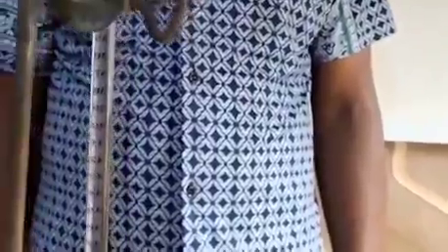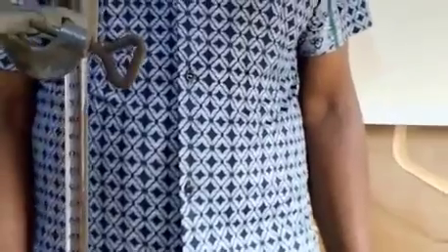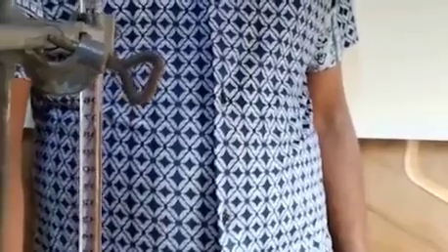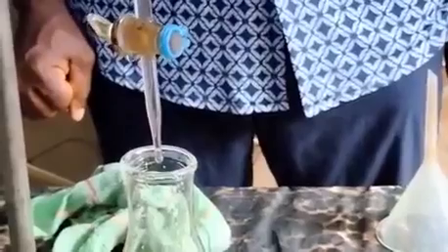So moving close to 30 now. We are almost there. At 30, I'll turn off the tap. So I have done that. Having done that, I'll open the tap again for it to go slowly, drop by drop. You can see that happening there, one drop at a time, approaching the color.